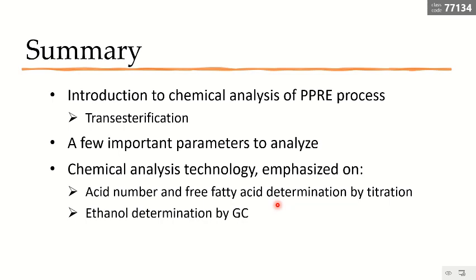We emphasize a lot the use of GC, gas chromatography, to detect the concentration of ethanol. We require you to understand this ethanol analytical technology and know some brief ways about gas chromatography. That is all for this topic 1 chemical analysis of the PPRE subject.